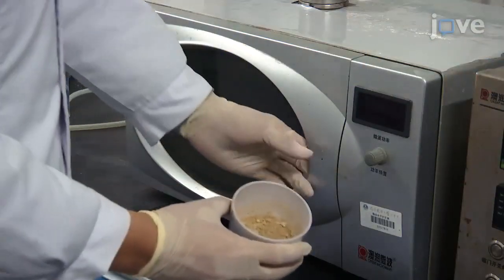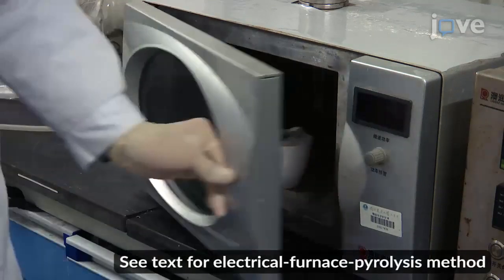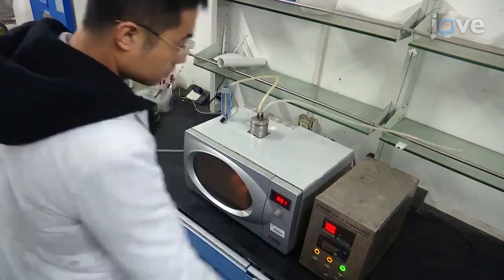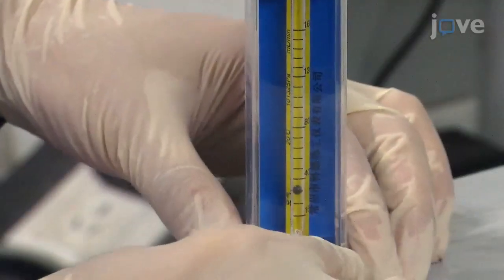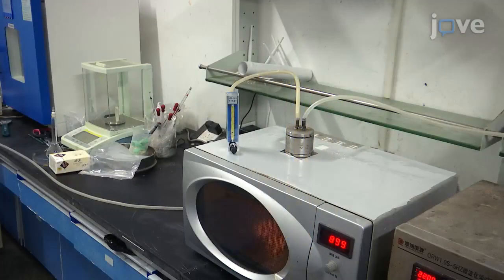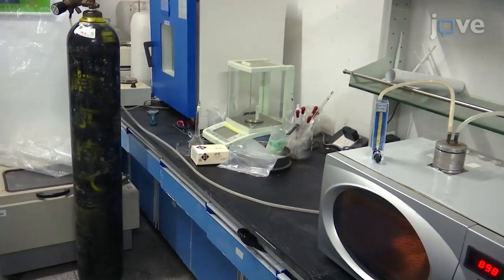Now, put 15 grams of the precursor in a microwave oven with a 2.45 GHz frequency. Set the power of the microwave oven at 900 watts to pyrolyze the sample for 22 minutes. Ensure a nitrogen flow rate of 20 milliliters per minute with a rotor flow meter. The air inlet of the rotor flow meter is connected to a nitrogen cylinder using a hose, while the outlet is connected to the air inlet of the microwave oven.